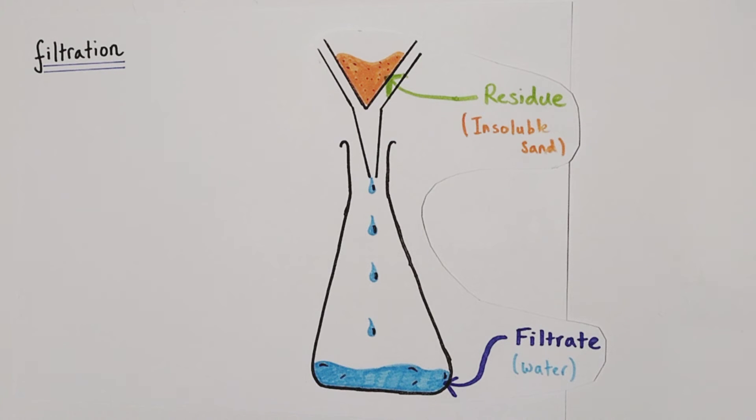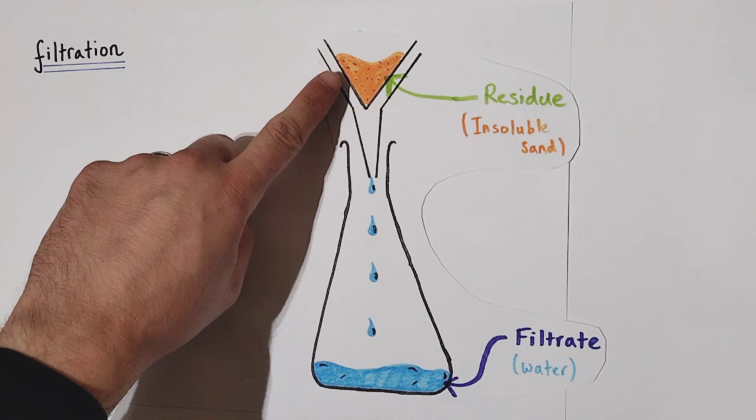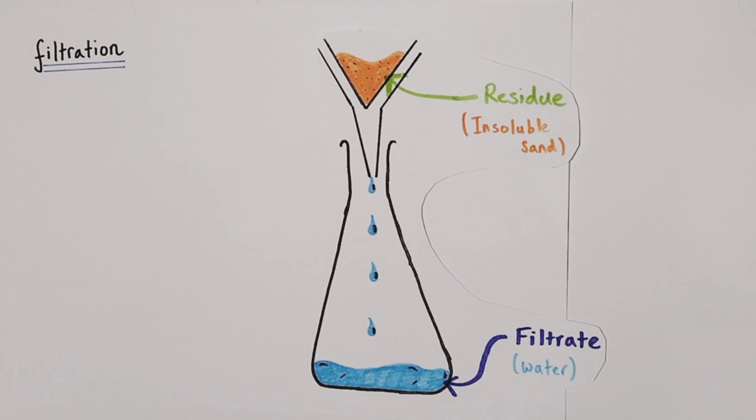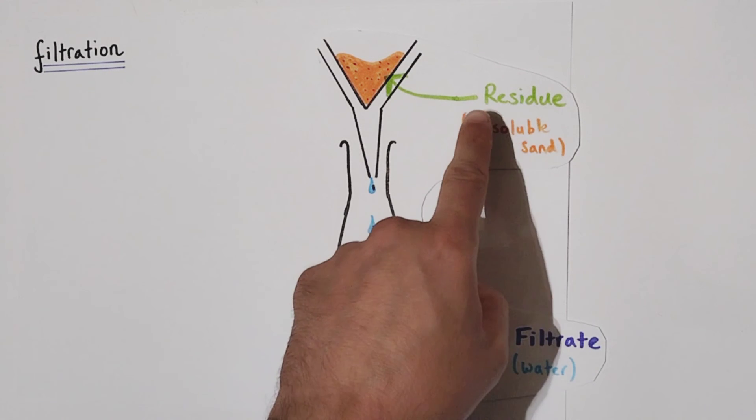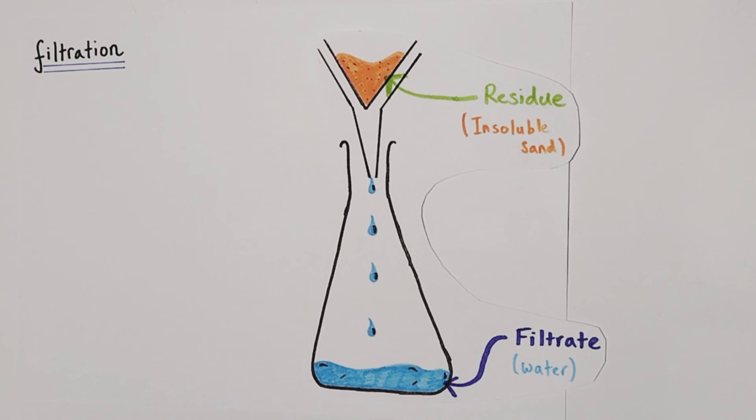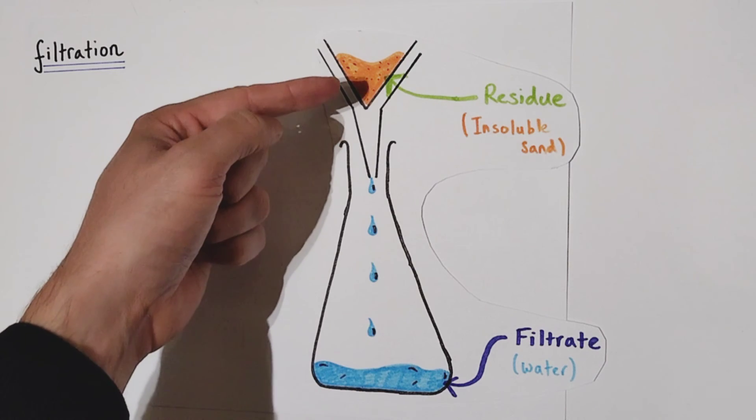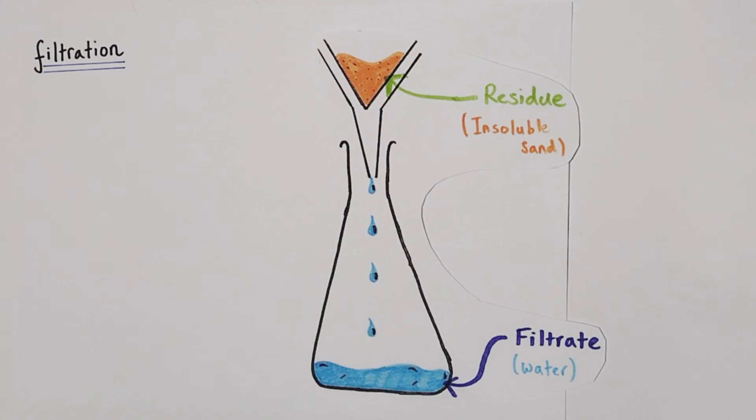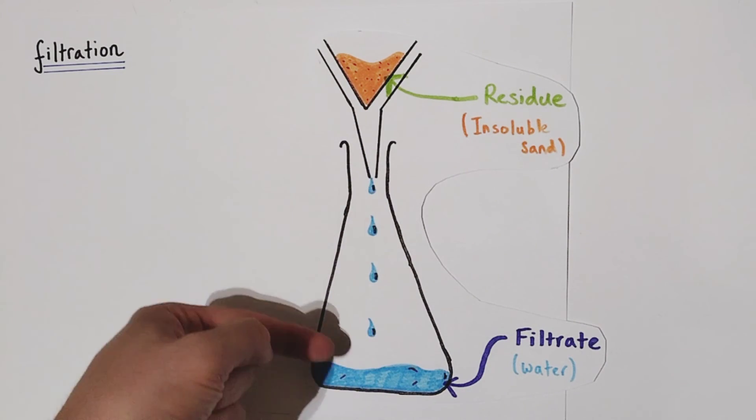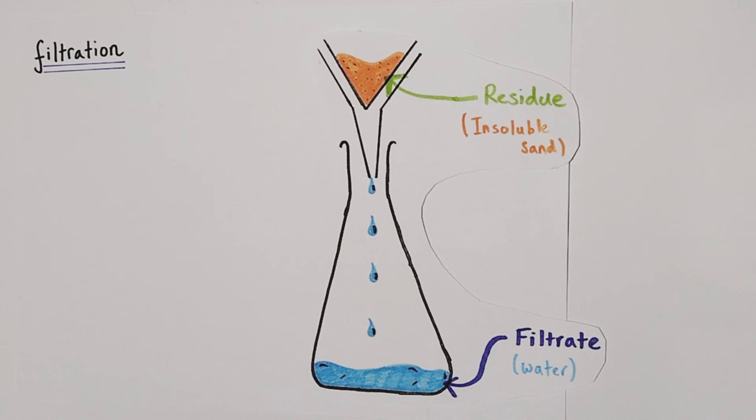What we have is a clear separation. The insoluble sand has been left behind on the filter paper and is now known by the generic term as the residue. Whilst the pure water has flowed through the filter paper down the filter funnel and into our collection vessel, in this case flask, and that water, that separate liquid, is generically known as the filtrate. Whatever passes through the filter paper we call it the filtrate.